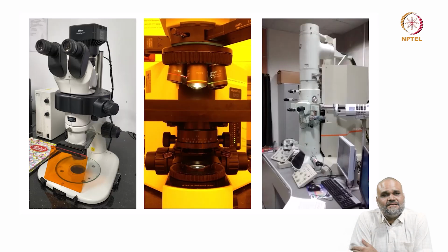So we've seen the trends in transmission electron microscopy: the improvement in resolution, and the developments going on, where you're trying to bring more experimental facilities into the microscope.